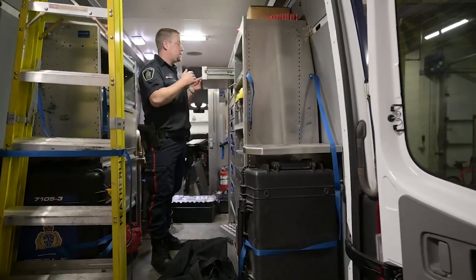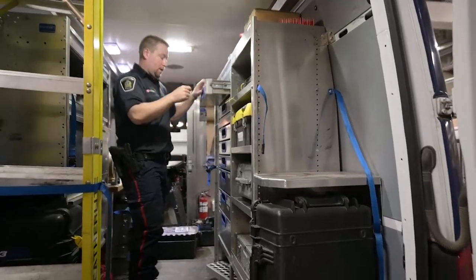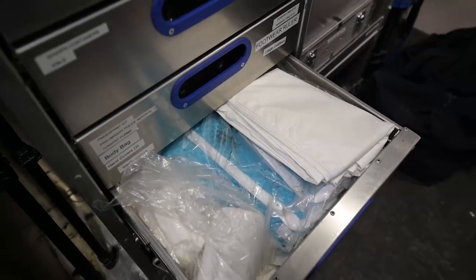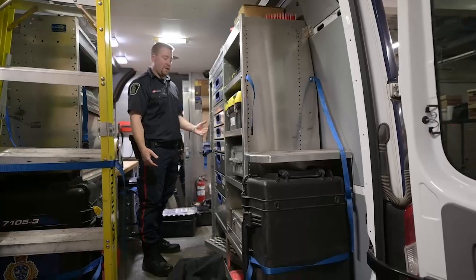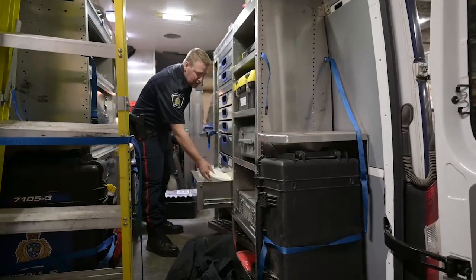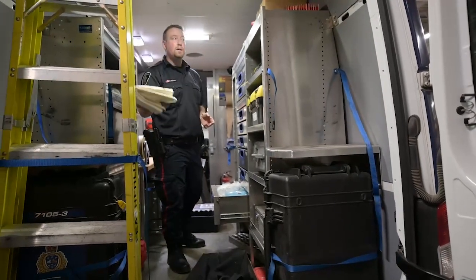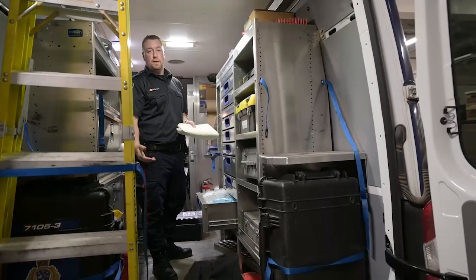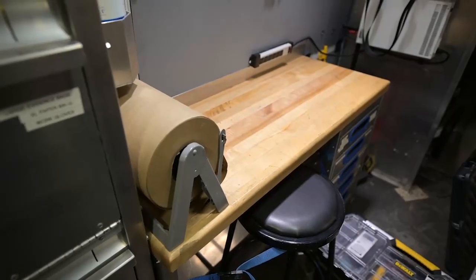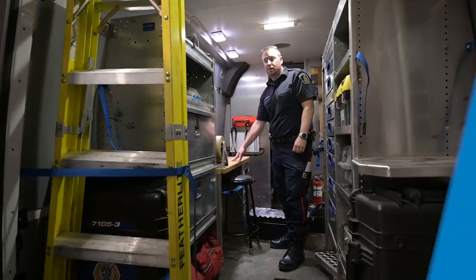We have swabs and masks that are used to collect DNA evidence at a scene. We have many different types of bags that are used for different situations. For example, fire debris would be packaged differently than any normal piece of evidence. We have Tyvek officer protection suits that we use to prevent us from bringing any material into a scene. We also have a ladder, and we have specialized lights for things like large low light scenes. We also have a desk here. Sometimes we're able to process evidence here or get our paperwork done while we're actually out at a scene.